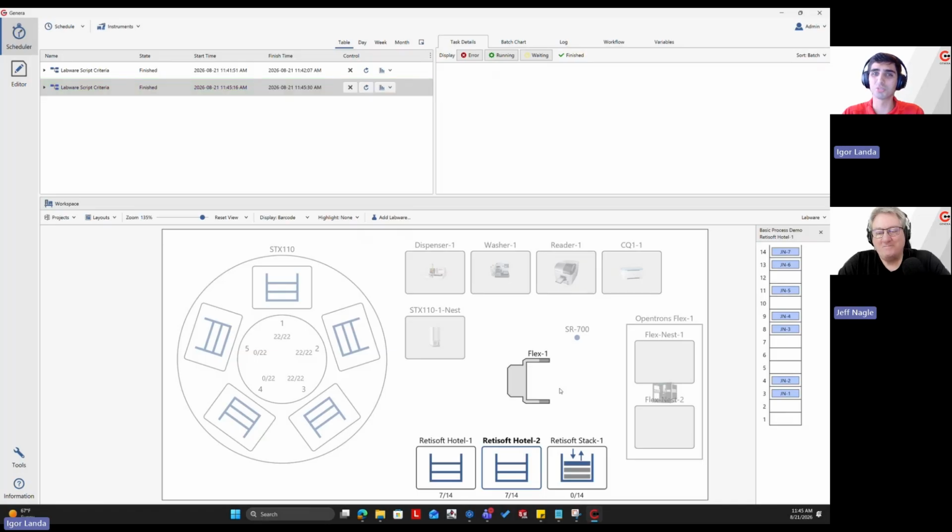So if you have multiple users whose barcodes have a certain initial or a certain sequence of characters, you could use the dot contains to segment out those plates. Yep. And again, the same rules apply as the last example: we did not make an explicit declaration of where these plates are. Genera, based on the contains of this subset of characters, knew where they were and pulled them out.